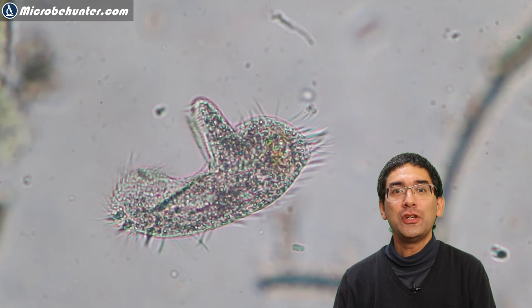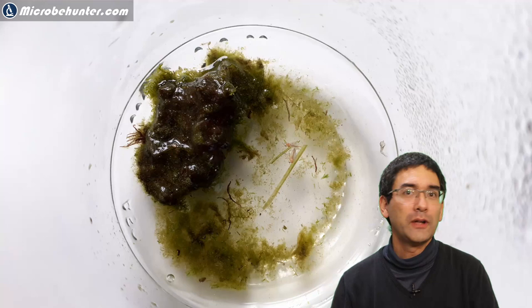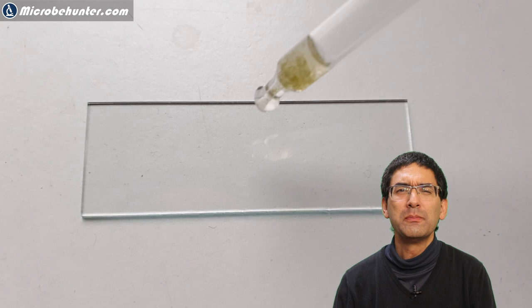Well, I added the algae, the sample, with a little bit of water, and then I prepared a specimen slide, relatively easy to do. I simply dissolved a little bit of the algae in the water. It started to smell already pretty badly, I have to admit.